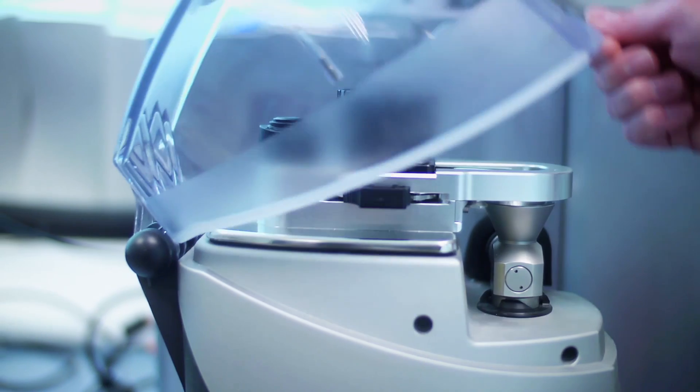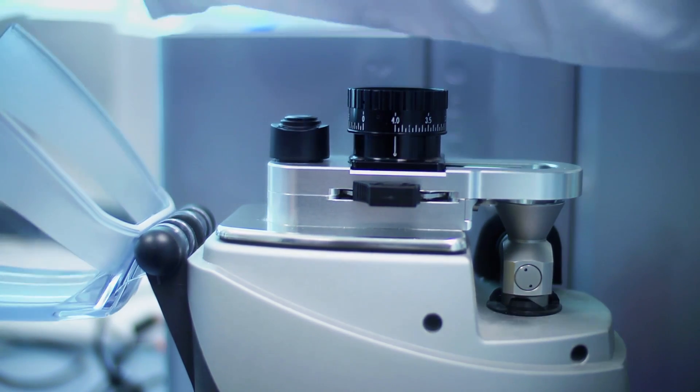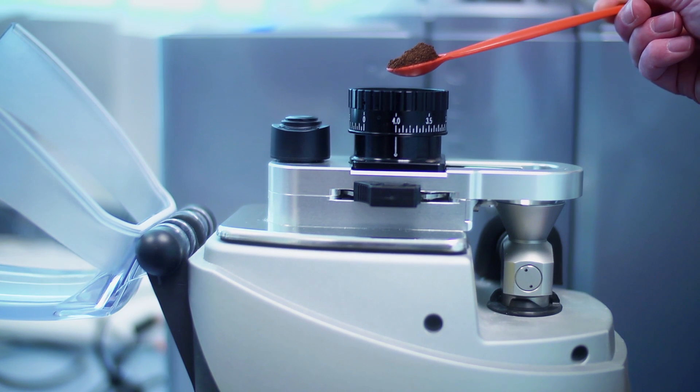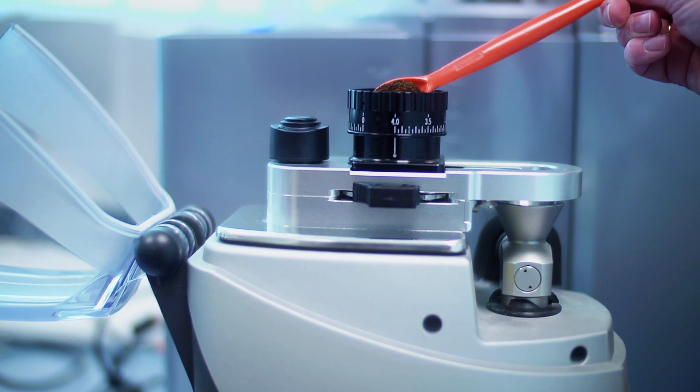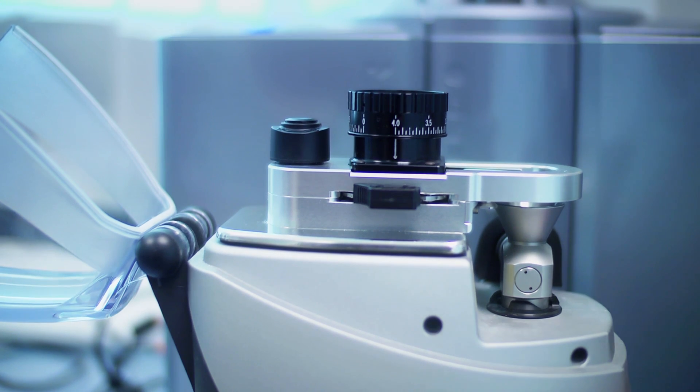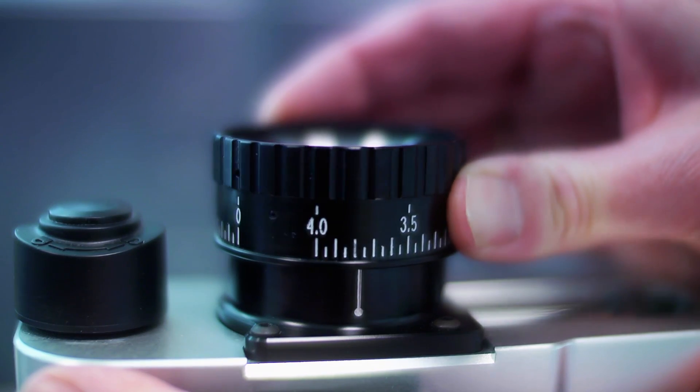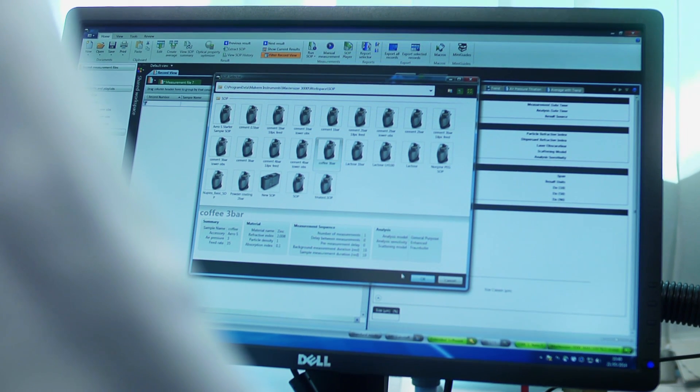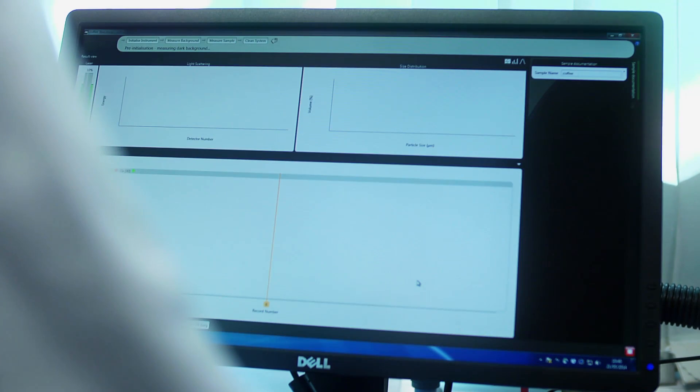Dry measurements offer the ability to quickly measure larger volumes of sample. The sample tray and hopper can be configured to control the flow of different types of material. Other sample trays are available to handle smaller sample volumes. As with liquid dispersion measurements, the Master Sizer 3000 measurement manager is used to guide you through the dry measurement process.